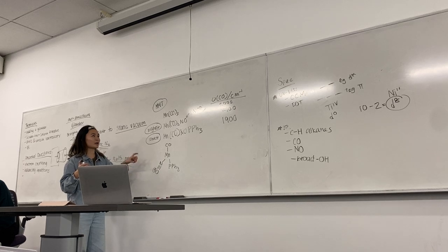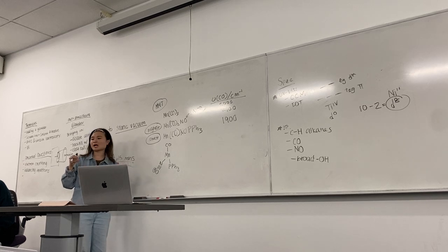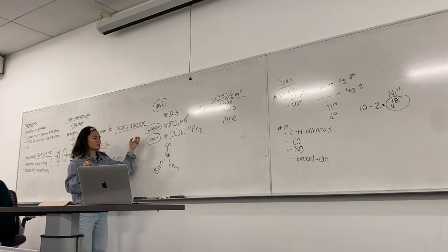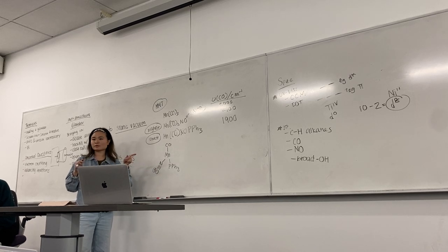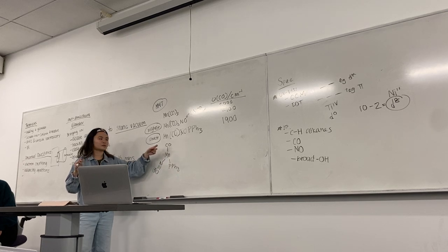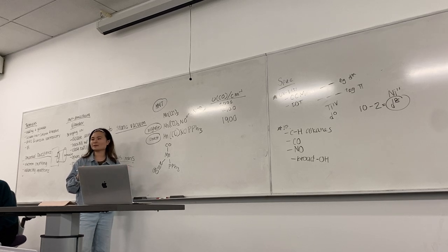So when we did our MMT lab, the one with just the nitrosyl compound had the highest IR stretching frequency. And then when we look at triphenylphosphine, it is the most electron donating of the three, which means it's donating electrons into the metal center, which can back bond into CO. I don't like this question because you're changing more than one variable at a time.